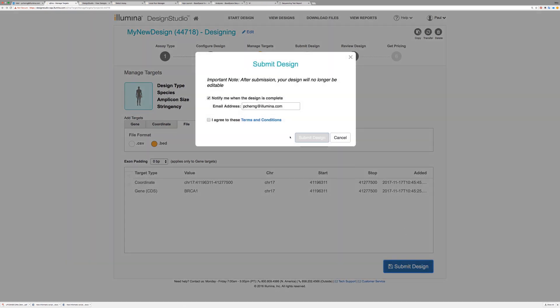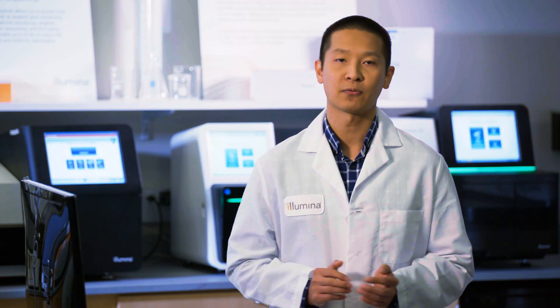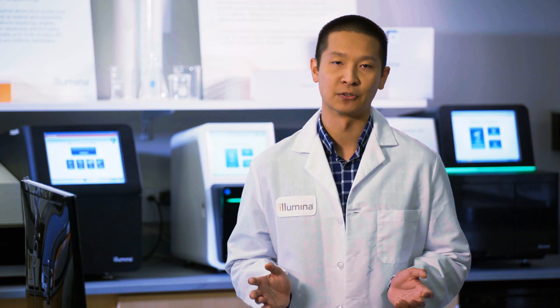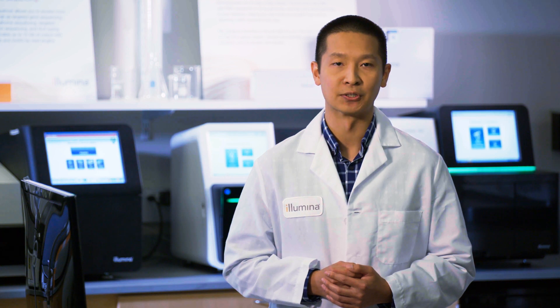Next, click Submit to start your design. The software is now processing your design. In a few hours, you'll receive an email when your design is ready for review.